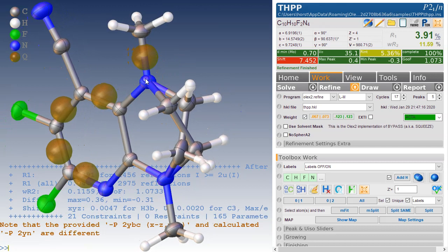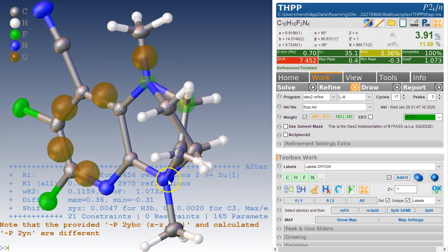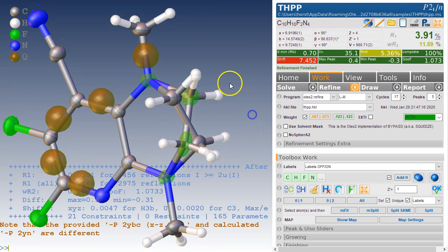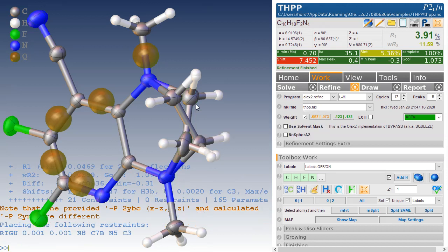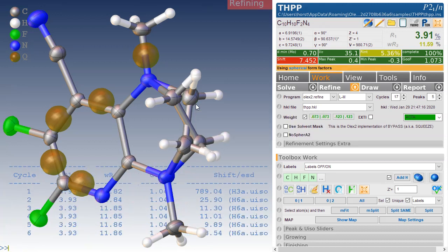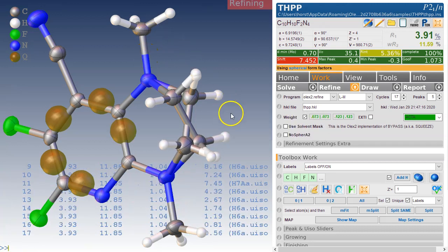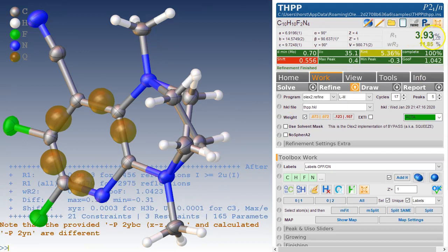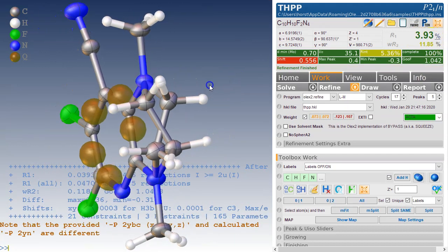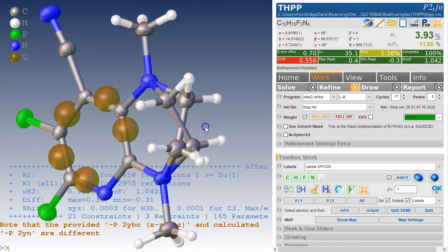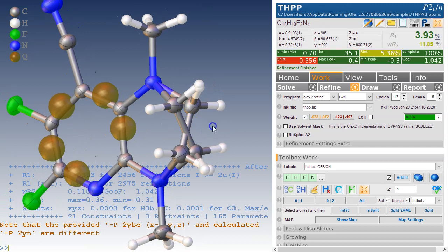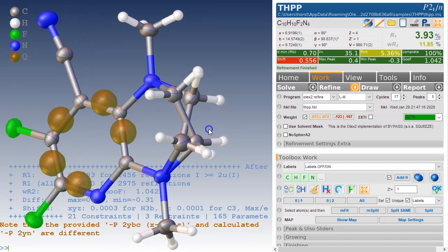One restraint we can use, we click on this, this, this, and this, and we can click on this. It doesn't matter really here, and we can use the Regu restraint. Make it fairly strong and see how that comes out. And now the rigid group is on at 3.91, 3.93. So the R factor hasn't really changed too much. I don't think we need any restraints on that because these are quite happy here. That is no problem.